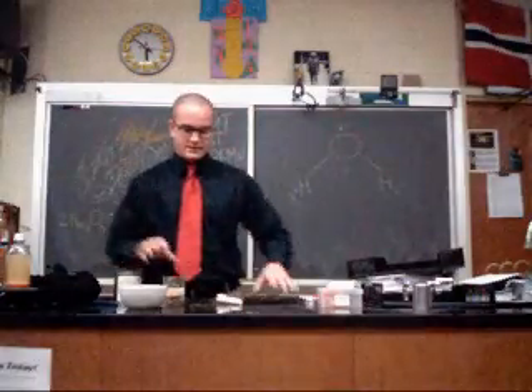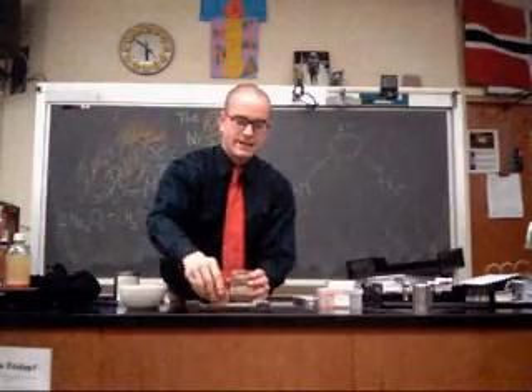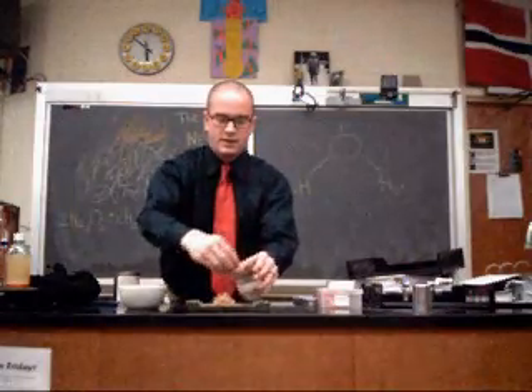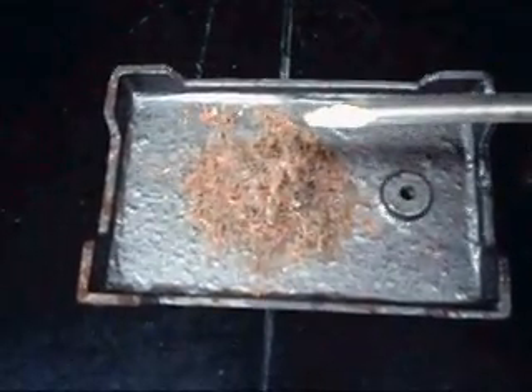So for this demo, what I decided to use is my kindling. It looks adequate like a rat's nest, and something that every classroom seems to have is plenty of pencil shavings. So we'll put these pencil shavings down here to develop our rat's nest, and then just sprinkle a little bit of sodium peroxide on the top. Just a small scoop from your scoopula should do the trick.